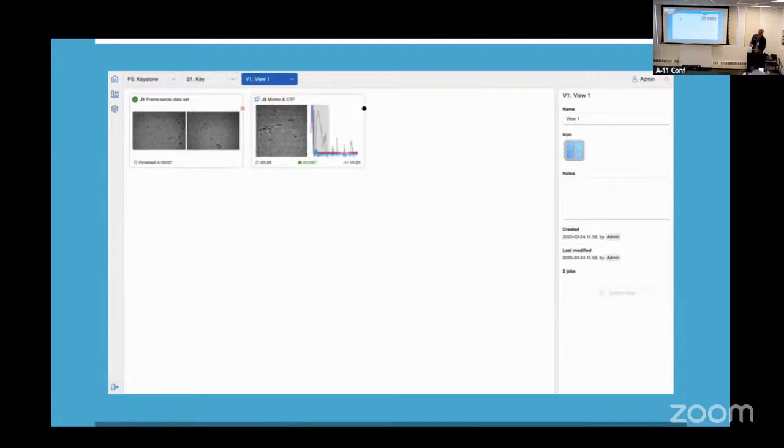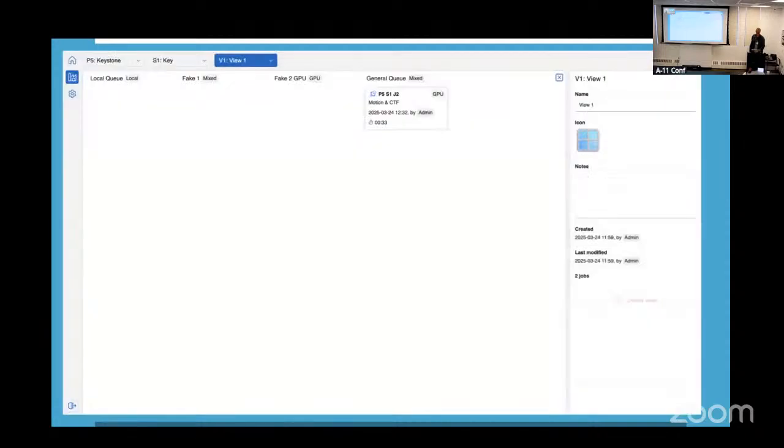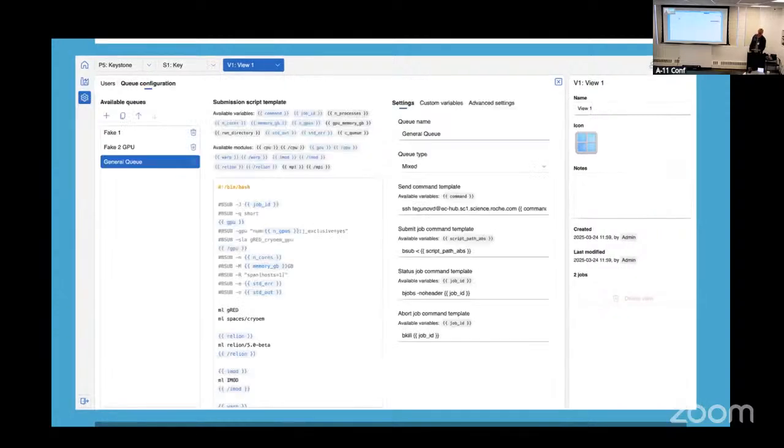Once the job is running, you can see running statistics for how things go, or some live updating status of the job, how long it's been going on for, whether it's waiting in the cluster queue, these kinds of things. You can see how the cluster queues are doing. Here we only have this one job running right now, but you can see which queue it's in, how long it's been running for, and if the queues are really backed up because, say, the cluster is down or something's jamming them up, whatever it is. You have this overview tab for viewing those things.